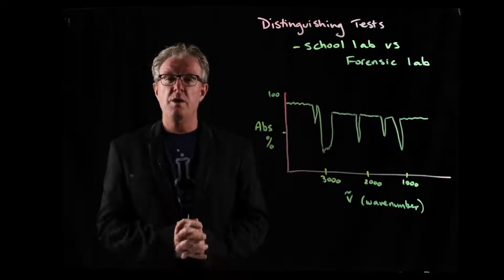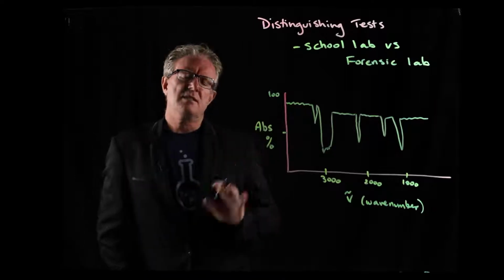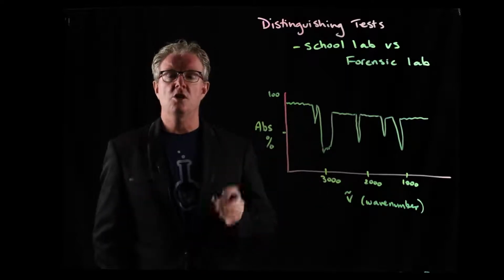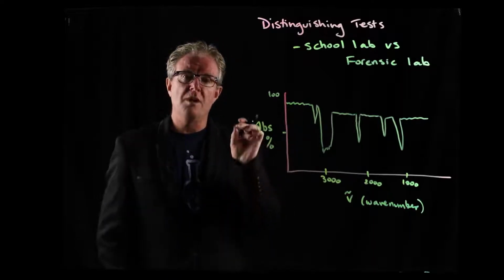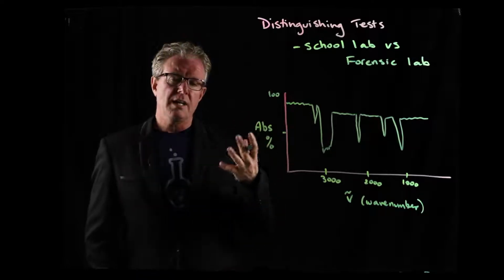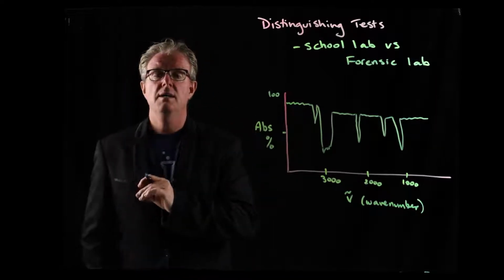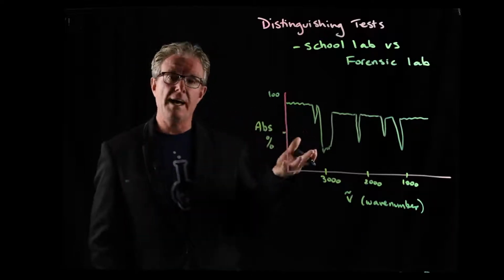Alright, now we're going to look very quickly at the concept of infrared spectroscopy. So in this technique, it's actually the absorbance of infrared radiation. Previously in the course we've looked at the atomic absorption spectrometer, which looked at the percentage absorbance of a particular wavelength of light by a molecule. So if we were looking at lead or magnesium, we would use a specific wavelength emitted from a hollow cathode ray tube that is characteristic for the absorption values of the electrons in that particular atom.